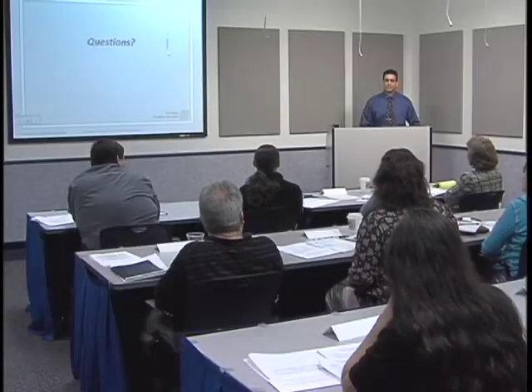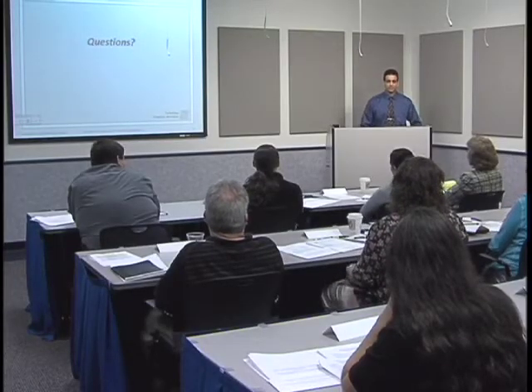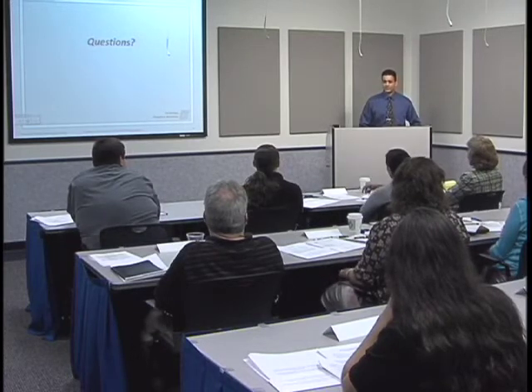It tells you, so you know. I mean, if you were just looking at it, not that you'd really want to sit there for 30 minutes and look at it, but if you were, like I did, you would see exactly which step you were at. You'd actually be able to see all the steps. So it was, like I said, a pretty easy system, and I didn't have any problems with it. And like I said, you all get to use it today, so you'll all see how easy it is.